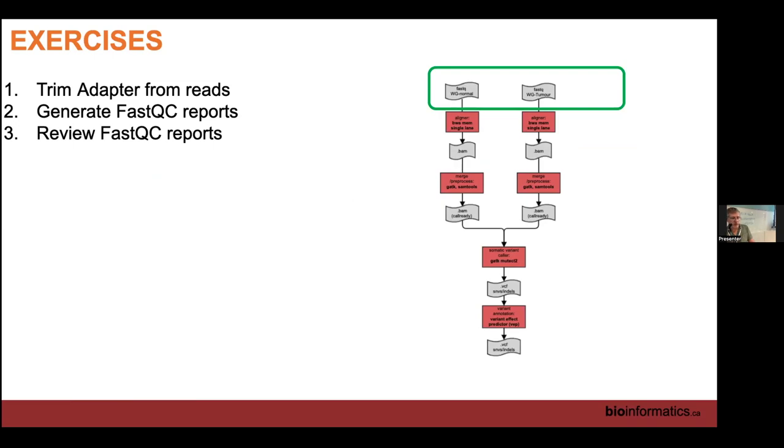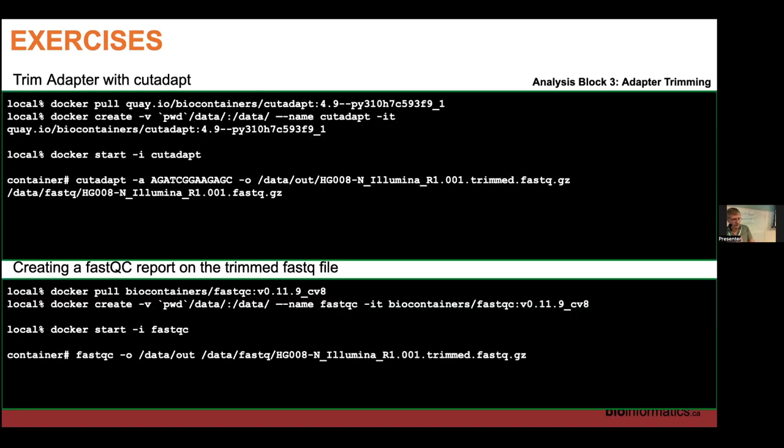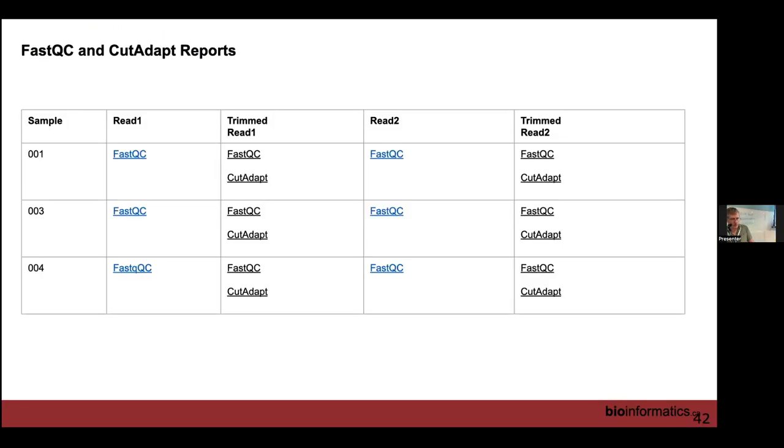And we have an exercise for that as well, using a tool called Cutadapt. With what we're expecting to be the adapter sequences, we can give those adapter sequences to that tool. It will go through and clean up our reads, cutting off that information. If it finds it's all adapter, it'll just get rid of those reads altogether. In the exercise, we show you the FastQC reports that were generated on that adapter-contaminated sequence. After we clean it up, we can run another FastQC report, and we'll see that a lot of that's been cleaned up. Those adapters should have disappeared. There are commands for running that, which we'll come back to. And I won't show the FastQC reports right now.